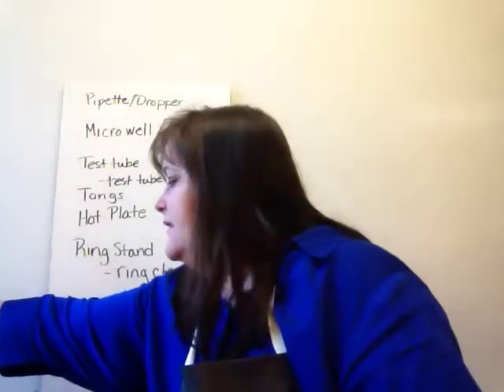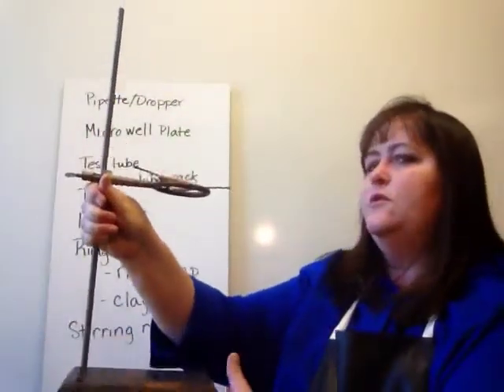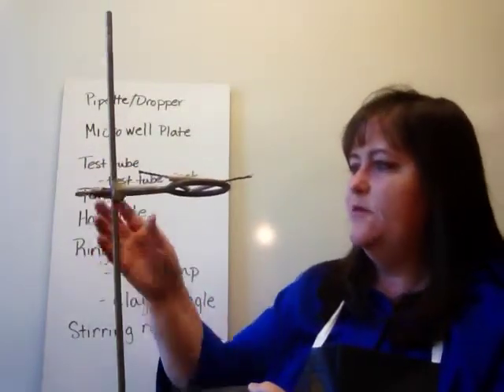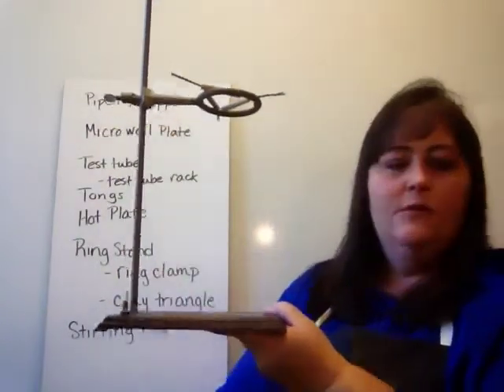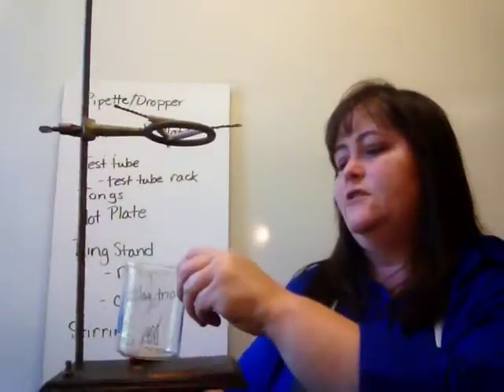This is a ring stand. It's very rarely used in our physical science lab, but you will be encountering them when you go into chemistry, your junior year. And the ring stand comes apart. There's a spoke here that screws into the base, and the base sits on the tabletop. You can put a beaker here, you can put a Bunsen burner here, whatever it is that you need.